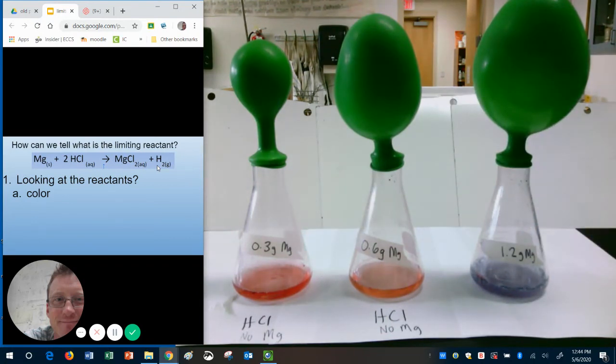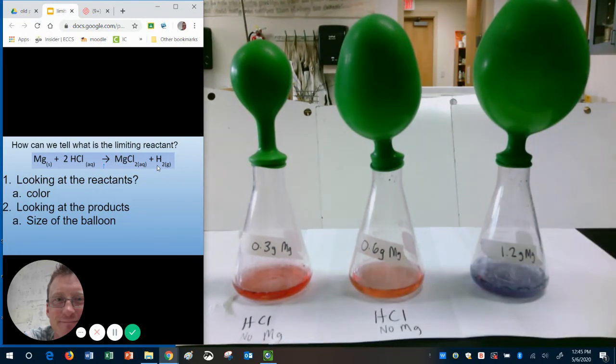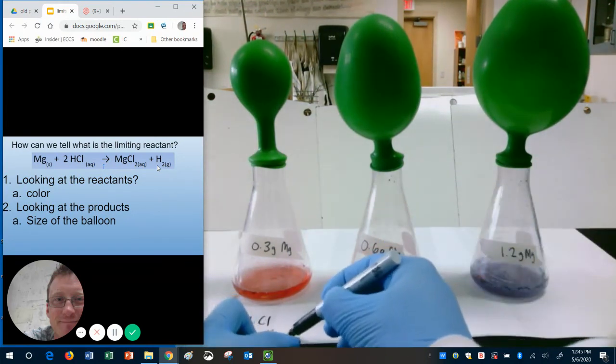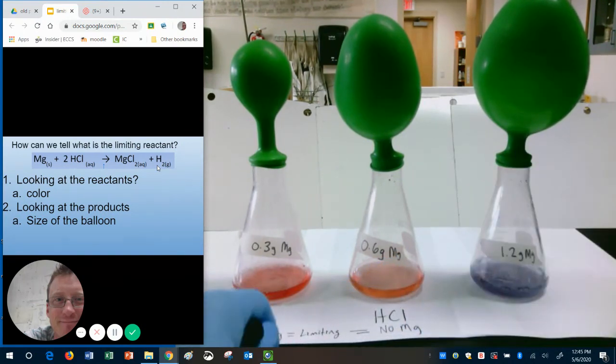Now, notice also the size of the balloon. We can also look at the products. Hydrogen is a gas. Well, looking at this, we can see that the amount of gas produced is different in all of these. And the reason for that is because more reactions happened.